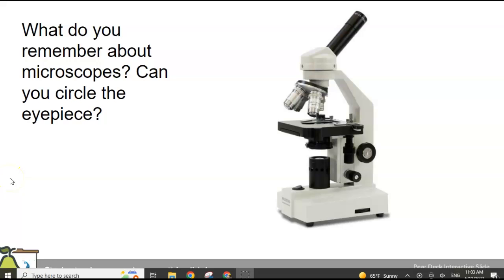Today we'll be talking about microscopes. If you're writing this in your own notebook, you can title it Microscopes. So we're going to talk about the parts of the microscope first.